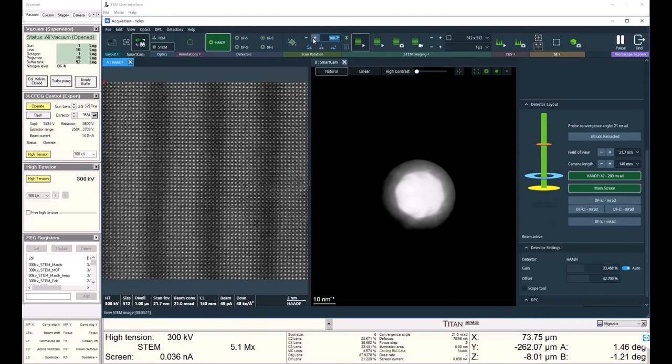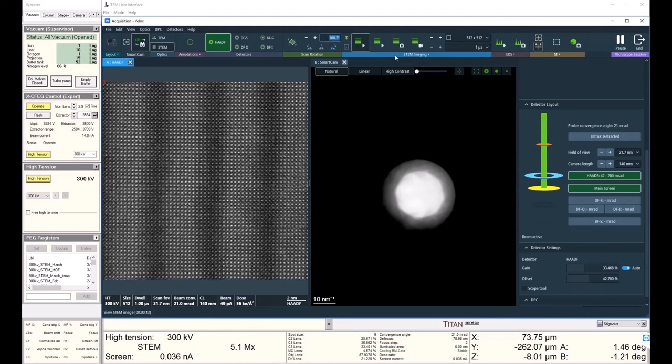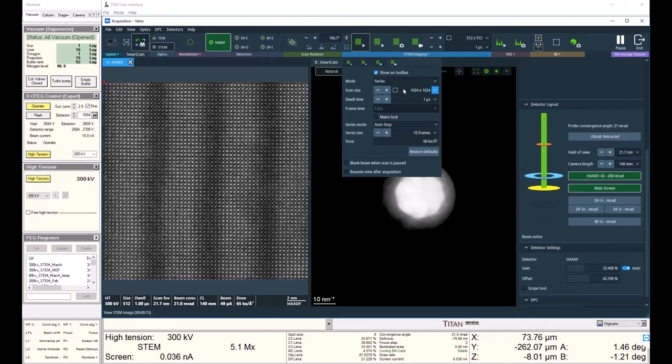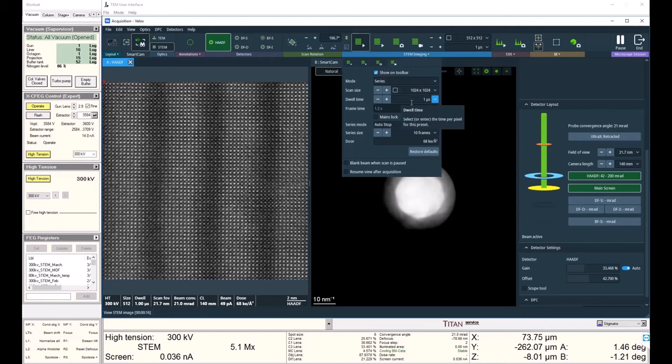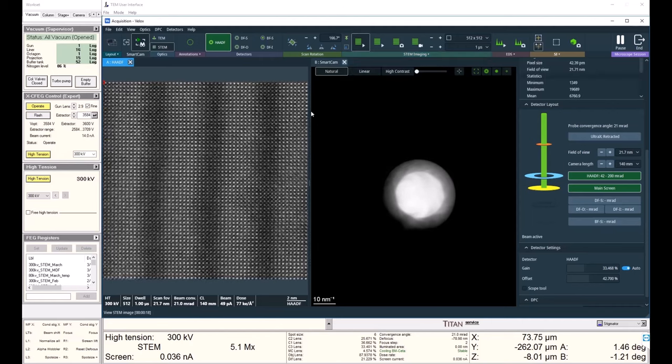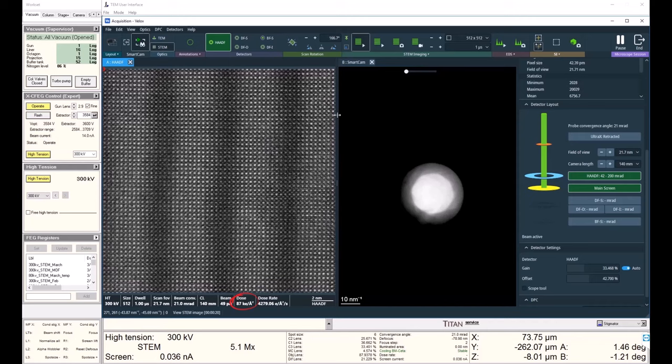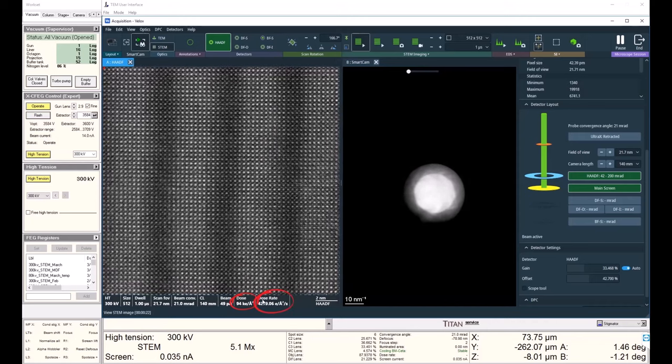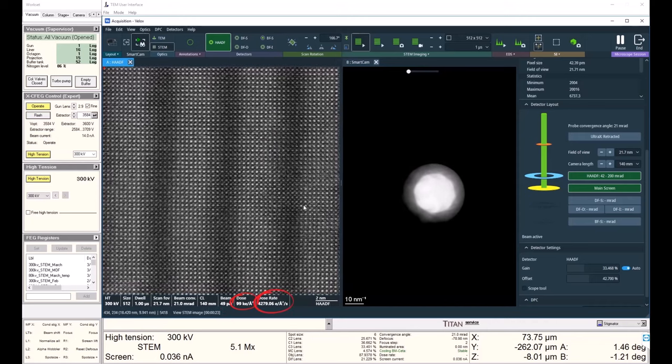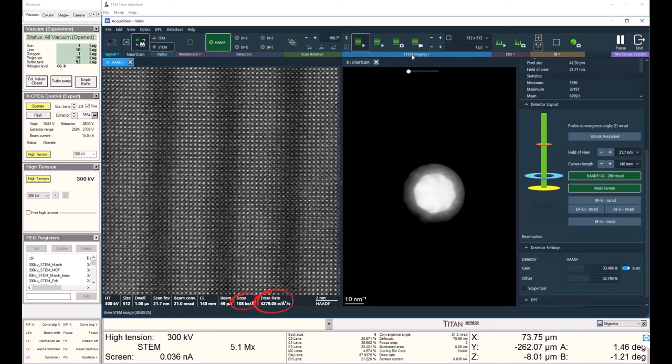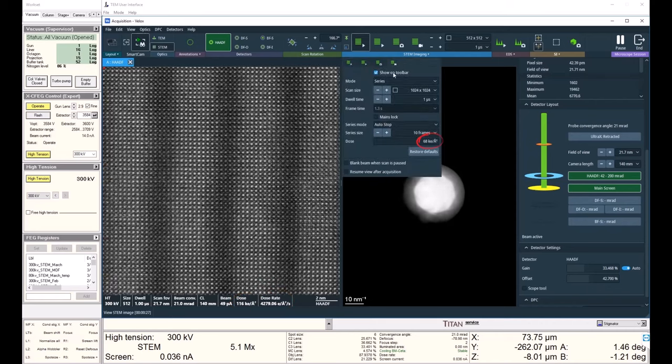I'll acquire a series of images at 1k by 1k and 1 microsecond dwell. I'm currently using about 80 kilo electrons per angstrom squared, and I can see my dose rate listed here with my 50 picoamp beam. And I can see my total dose listed here.